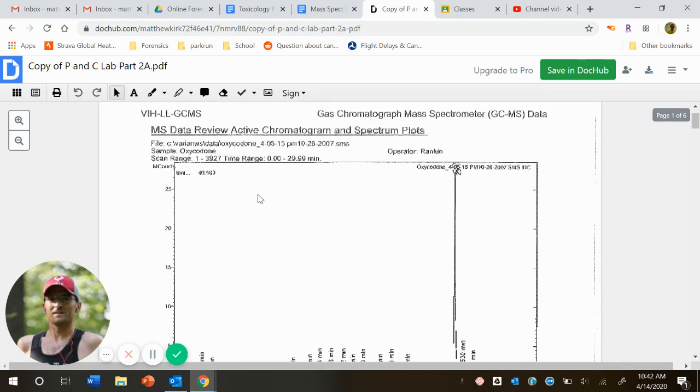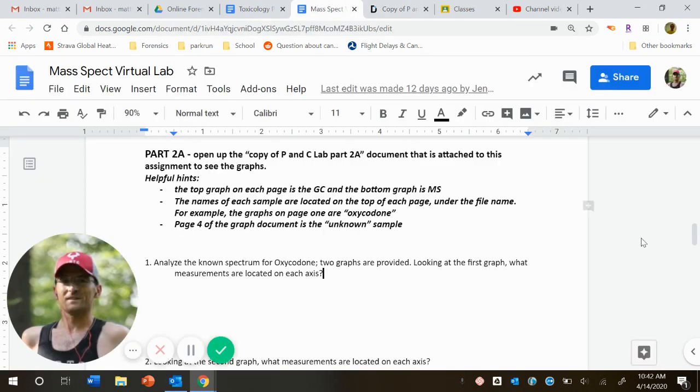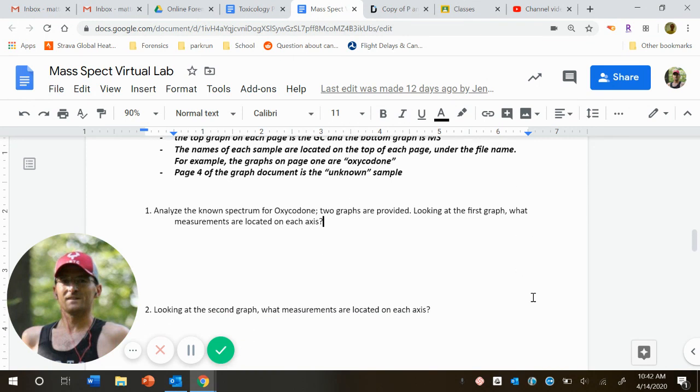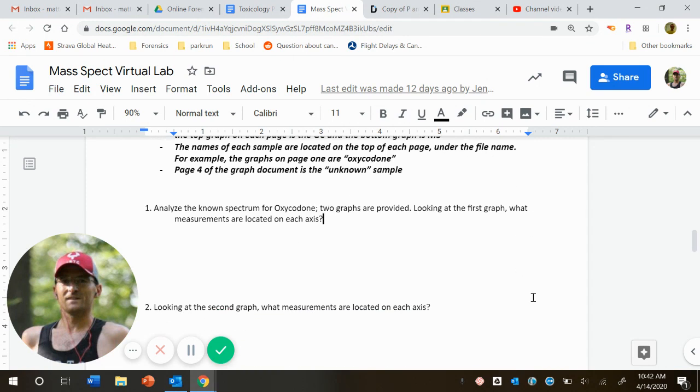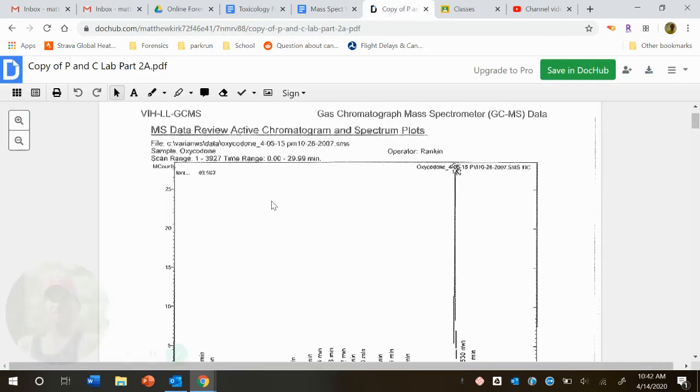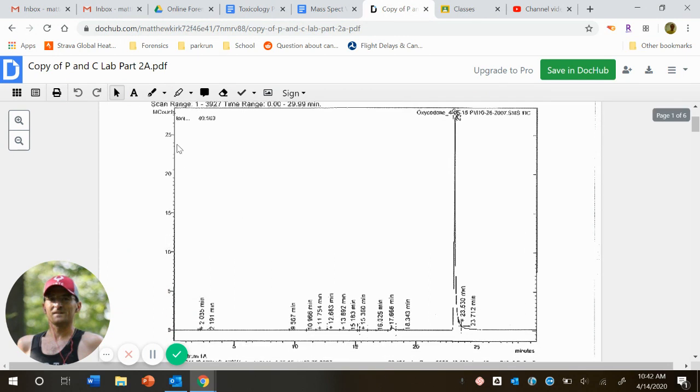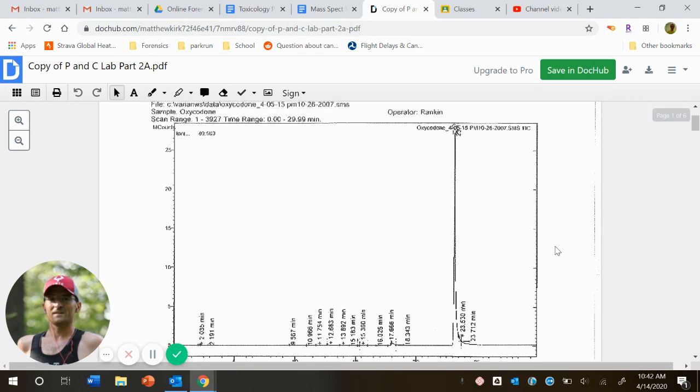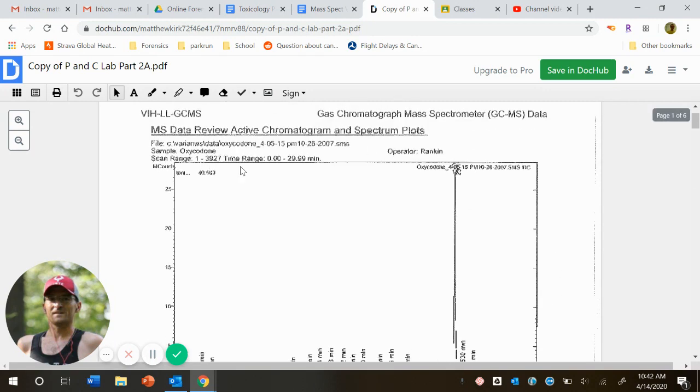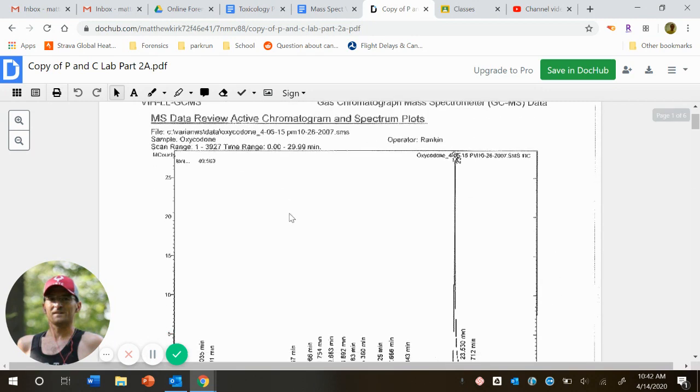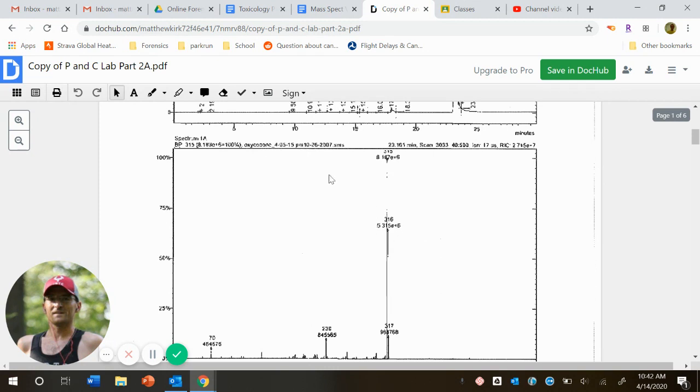Okay, let me flip back to our directions here. So we kind of ran through all that. So I kind of told you measurements on each axis. So let's look at our first graph again. So again, remember our first graph is the gas chromatogram. Y is count or intensity. And x is minutes. Remember this is our gas chromatogram. And then under that we have our mass spectrum data.